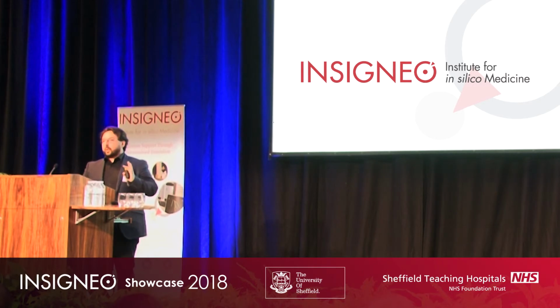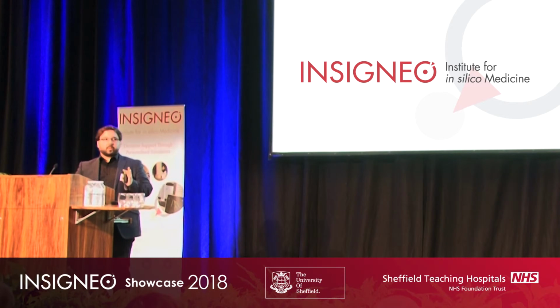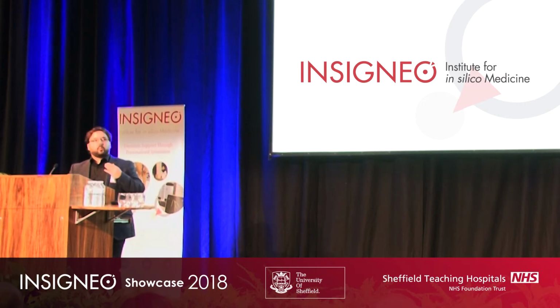So this result is very busy. I don't want you to go into the details, of course. If you're interested in the details, please look at the papers referred to at the bottom. Basically, what I wanted to show you is that we have fairly good to excellent correlations in displacement predictions for all three types of bones that we analyzed. Of course, for the mouse tibia, you can see that we have some more variability in the measurements and higher errors, and we are working on the modeling side to see if we can improve that prediction.